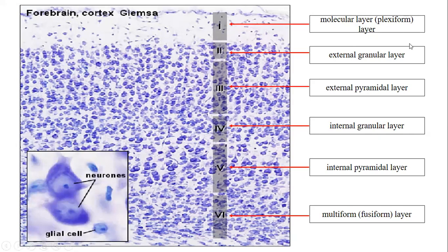Assalamualaikum and good morning. Today we're going to have a practical session on the histology of the central nervous system. Previously I gave a lecture on the histology of the central nervous system. Now we're going to see the histological components of the central nervous system.